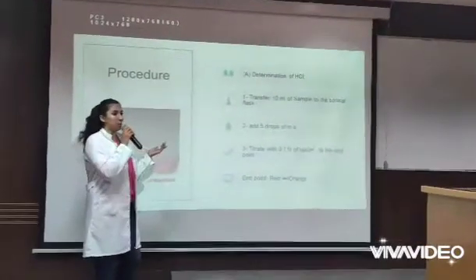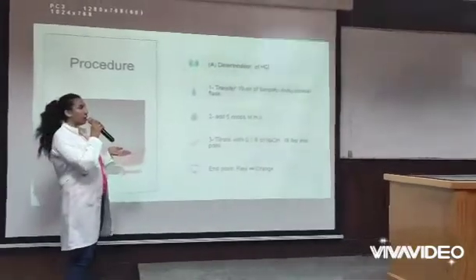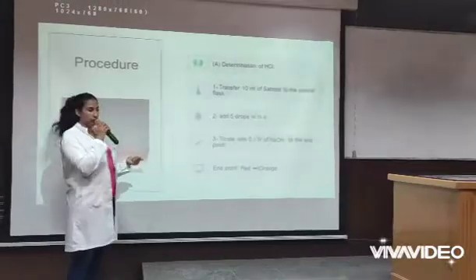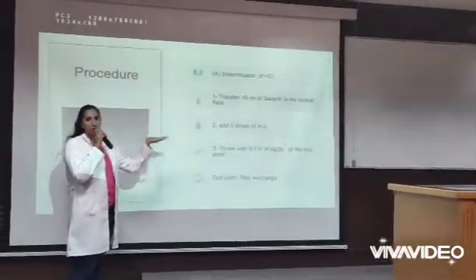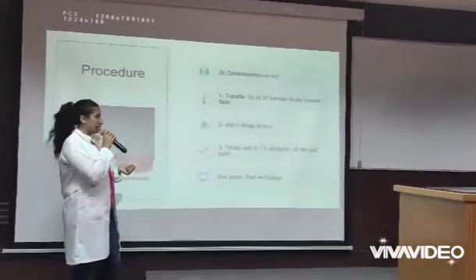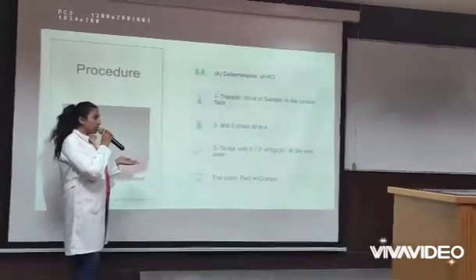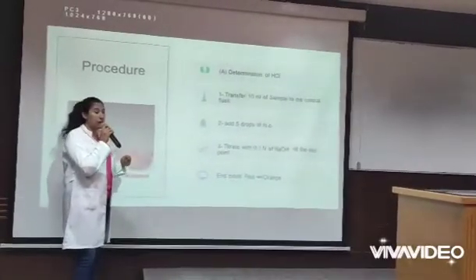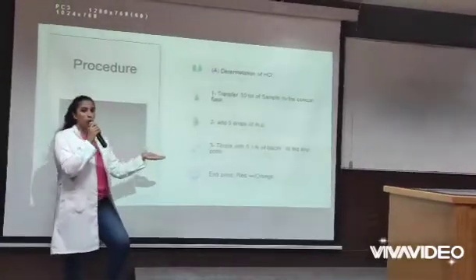Now we will start the procedure for the determination of HCl only, using methyl orange as an indicator. First, transfer 10 mL of the sample into your conical flask. Our sample here is a mixture of HCl and acetic acid. Then add five drops. Titrate with 0.1 N NaOH till the end point is reached.